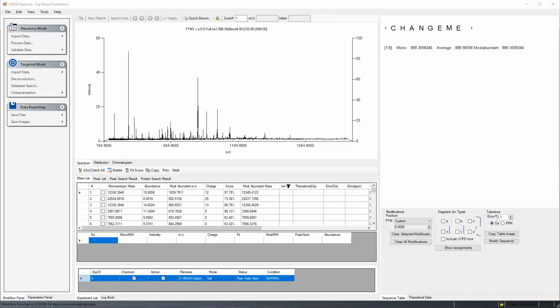For the targeted mode, it is recommended for users to provide as much information as possible, as extraction of information from MSMS files is harder compared to LC-MSMS data. In the advanced settings, users can input the charge state of the precursor and the fragmentation activation method. This information will help substantially in file parsing processes prior to the database search.